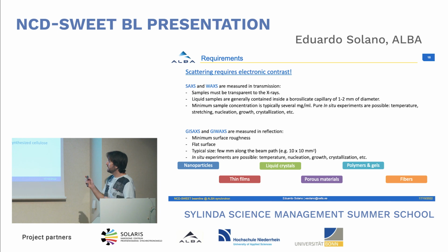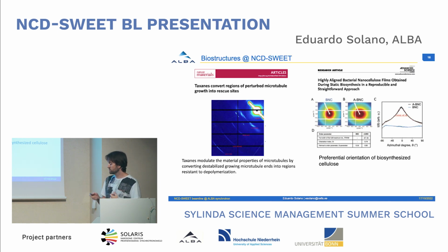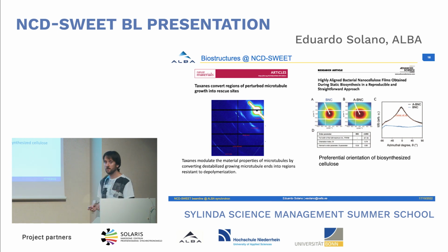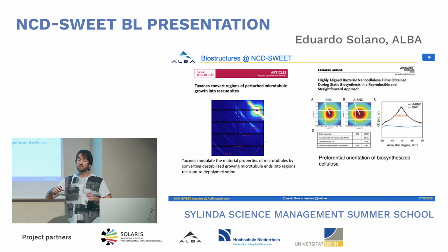So I divided this, by the way, into 4 kinds of topics. The first one is biostructures. Here, this is to investigate how microtubules are stabilized by exposure to different drugs. In this case, they discovered that the taxanes can modulate the material properties of the microtubules, making them much more stable. And you can do this in situ. So you have the liquid with the microtubules, you see them, you inject the drug by a remote system, of course, you cannot be inside while this is working, and then you see if the microtubule structure is changing or not.